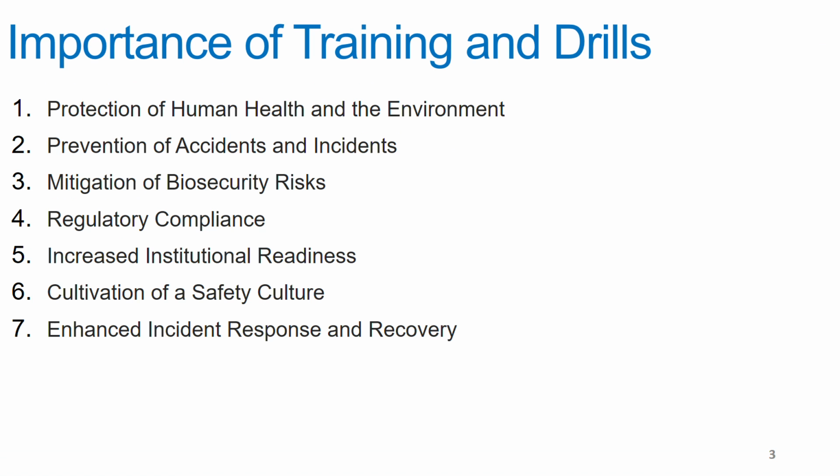So what's the importance of conducting trainings and drills, either in your facility or laboratory? Why is it important to conduct trainings? One of the major reasons is the protection of human health and the environment.